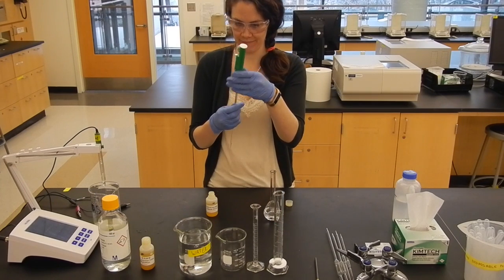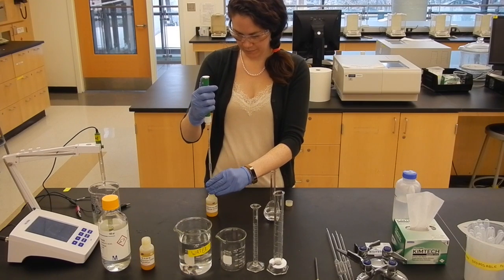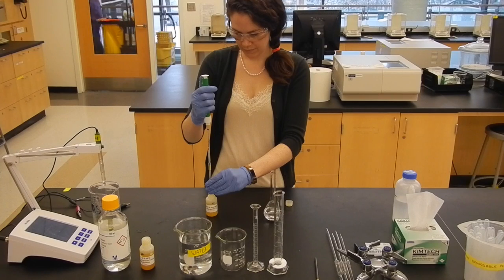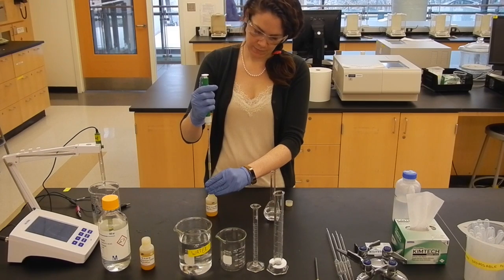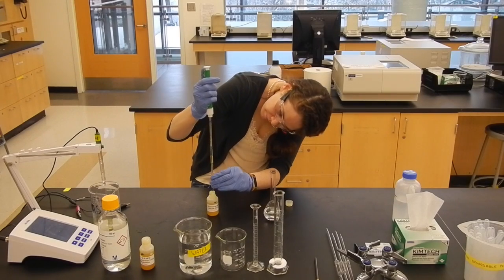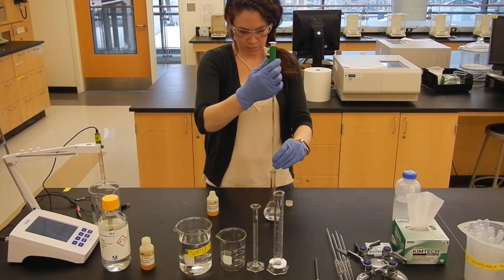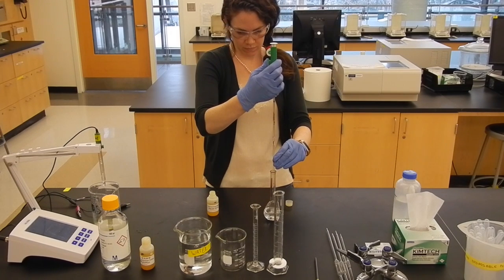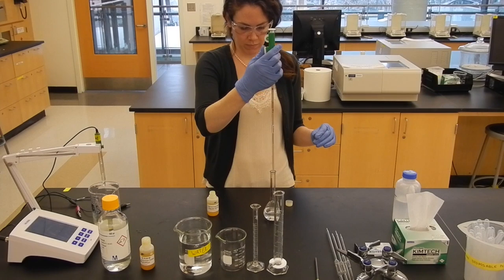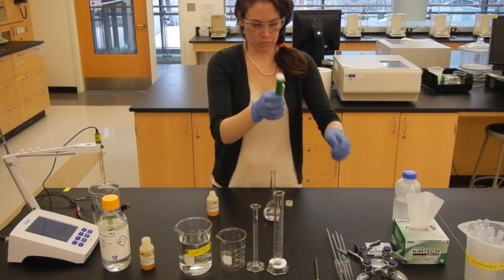Carefully pipette 1 milliliter of iron chloride into the 100 milliliter volumetric flask. Remember that pipettes are calibrated to release the measured volume on their own.